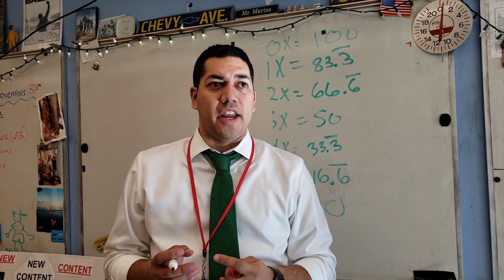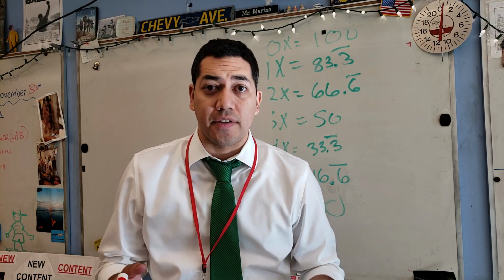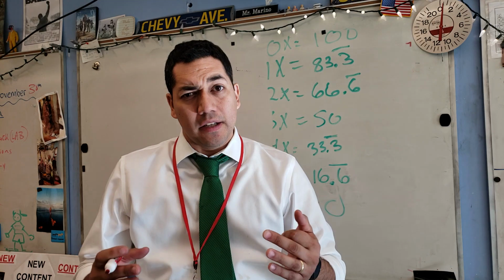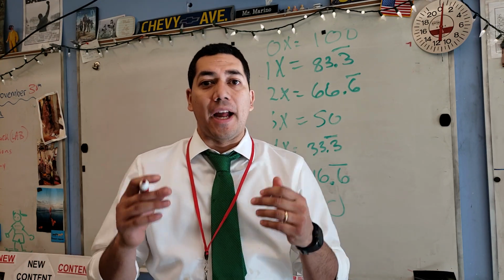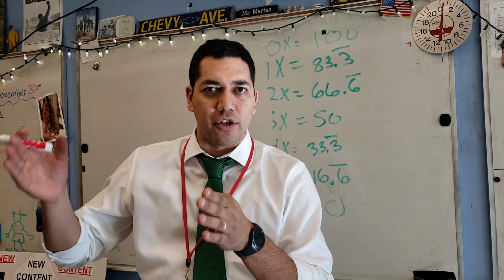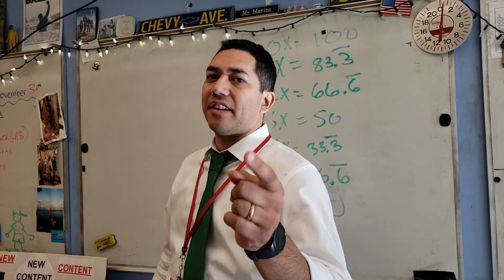First things first, you take the most dense liquid according to your calculations, and you measure out anywhere between 30 and 50 milliliters of that liquid. Now, pay attention to what number you use, because that's the amount you're going to use for each liquid when pouring them into the glass beaker. Make sure you use a glass beaker.